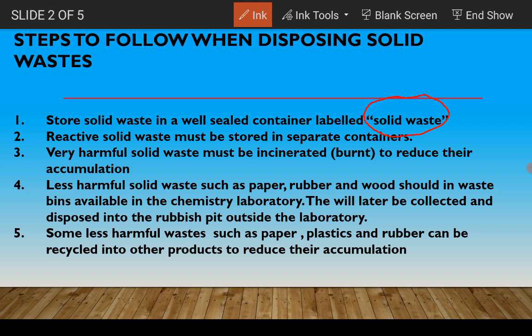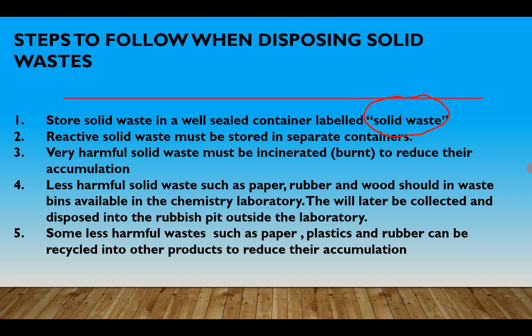All solid waste will be deposited into it. So we are saying store waste that is in solid form in a well-sealed container labeled solid waste.